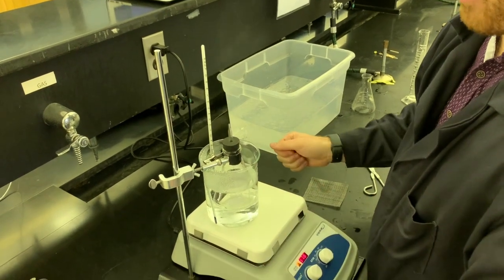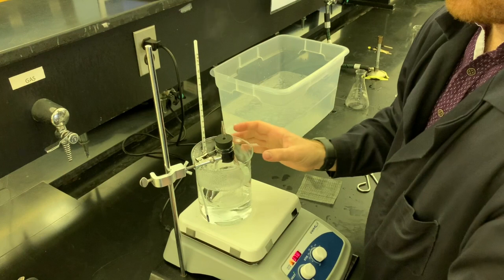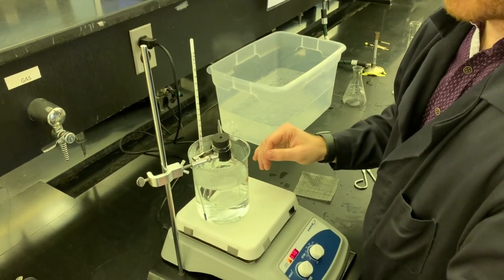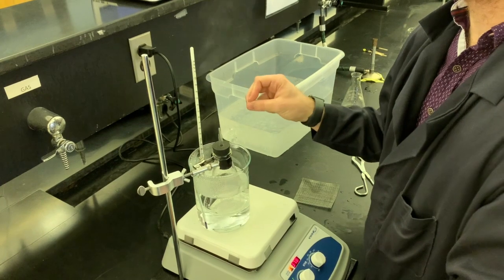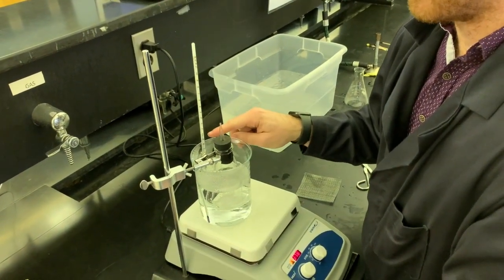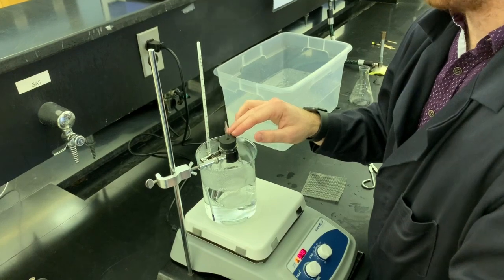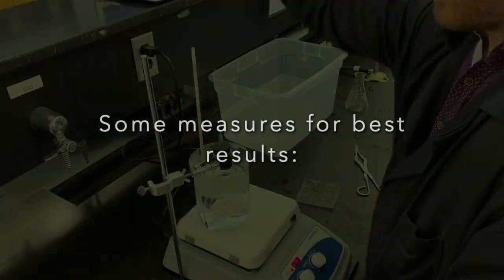Looks like we're running at about boiling, and once you get a boiling temperature in your flask, you should wait about 5 minutes to make sure that all of the air inside the flask acclimates to this boiling temperature. And once you get to that temperature, those 5 minutes, you're going to record the temperature again just to make sure that you actually are recording the initial temperature as soon as the flask leaves the water and goes into the ice bath for that big temperature change.